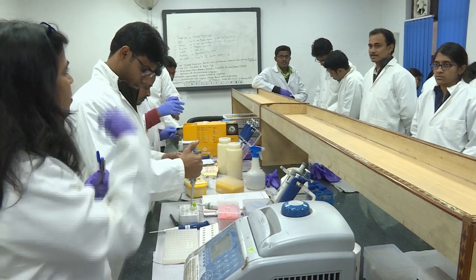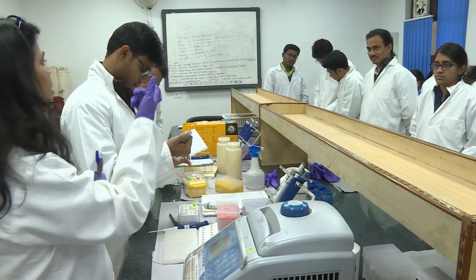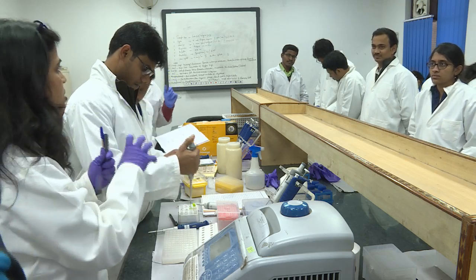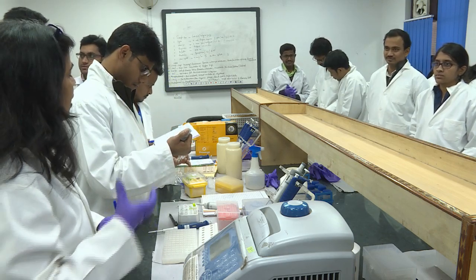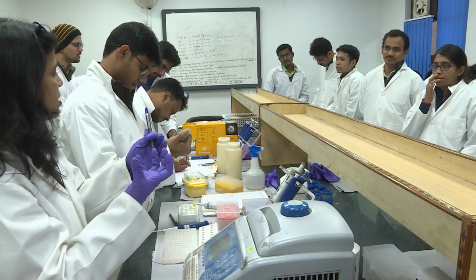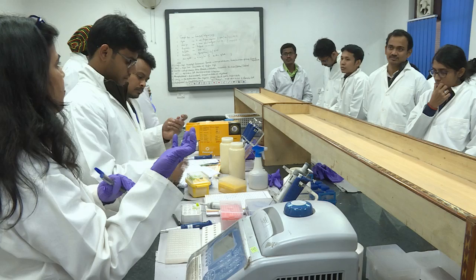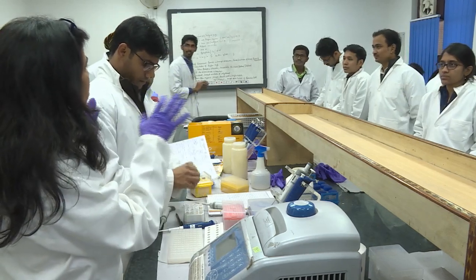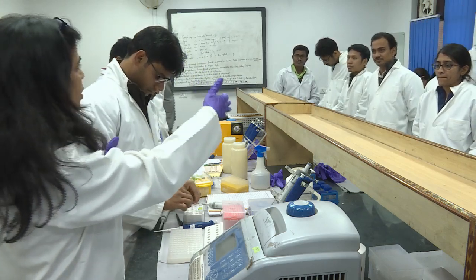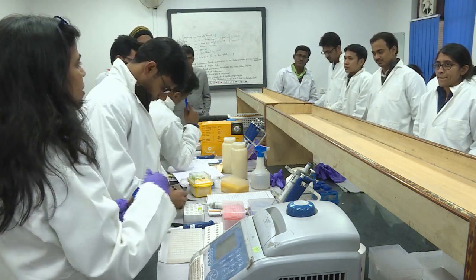Because sometimes I may be giving you 5x concentrated, and at another place you are getting 2x or 1x. So, you have to do the dilutions according to the concentration of your stock, right? And the same thing is with dNTP, MgCl2, primer, because there is one stock concentration and what is your requirement, the working concentration, accordingly you do the dilutions, right? Dilutions you all know, C1V1 = C2V2, right? So, please make your individual dilutions in your notebooks just for practice, and then you start doing it, right?